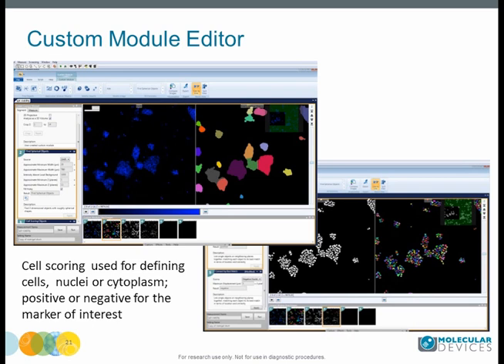Compound treatment resulted in decreased numbers and size of colonies and also decrease of the number of live cells and total cells. 3D analysis links the objects in different Z-planes and also enables characterization and morphometric analysis of spheroids in 3D.